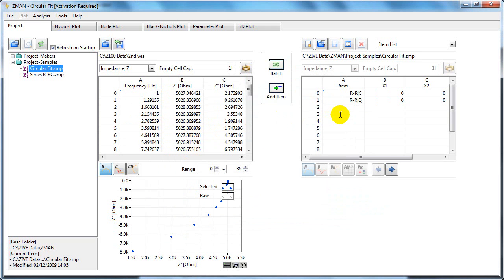Now if you want to move it to the analysis section, you should click add item here. So it gets moved to here.